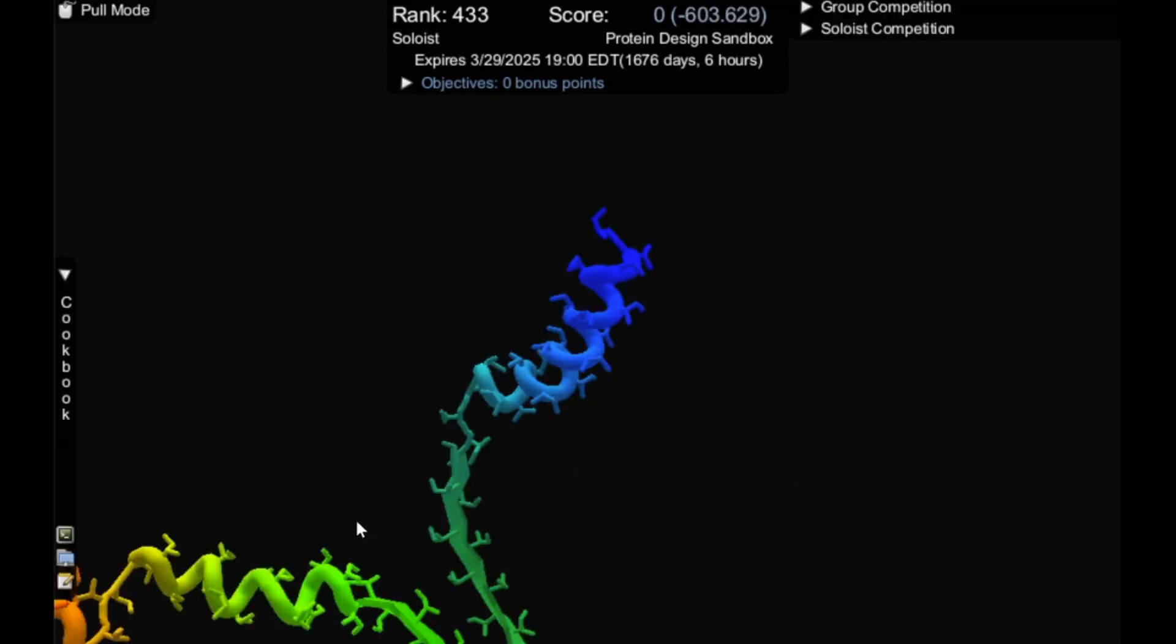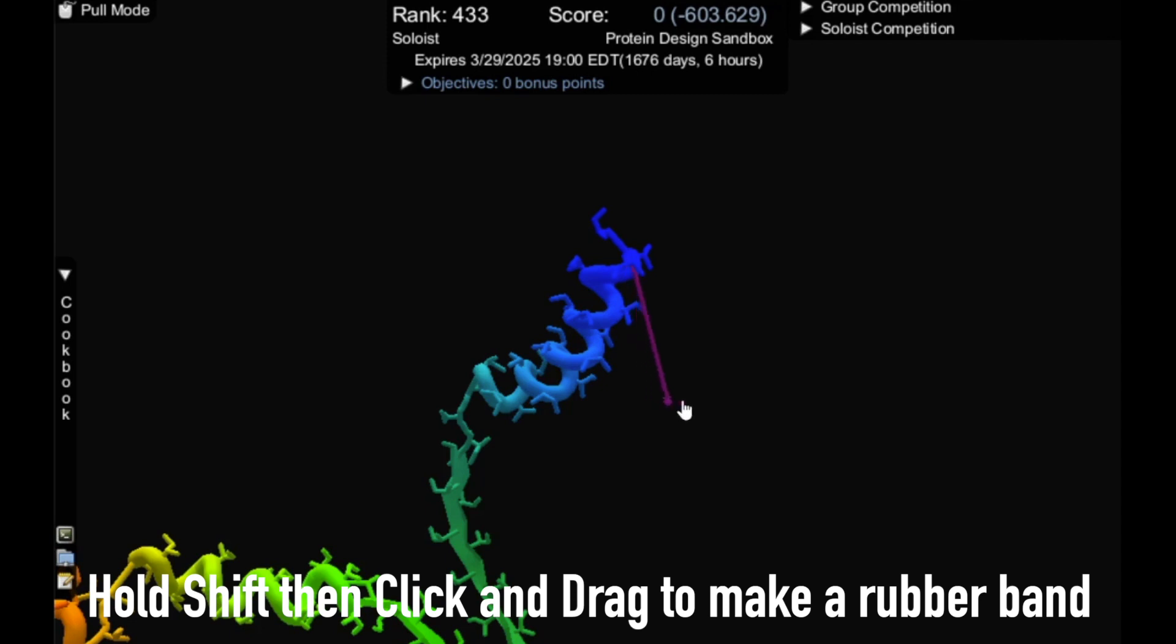To make a rubber band, hold shift and click and drag from the protein to where you want the band to. Notice that the band will snap to where I'm hovering over the protein, but I can also drag it out onto the background to make it a band in space or space band.